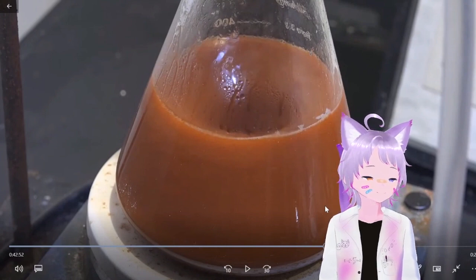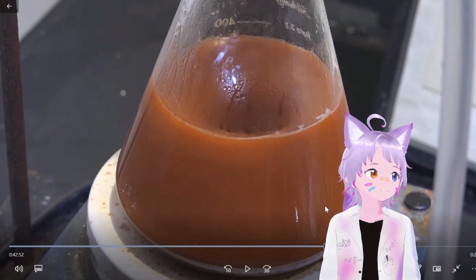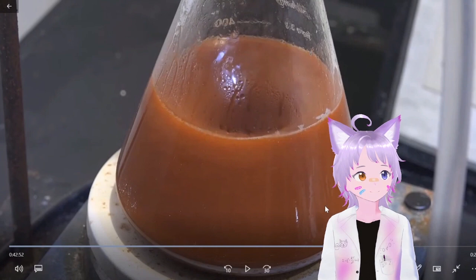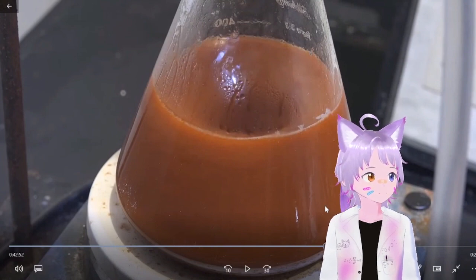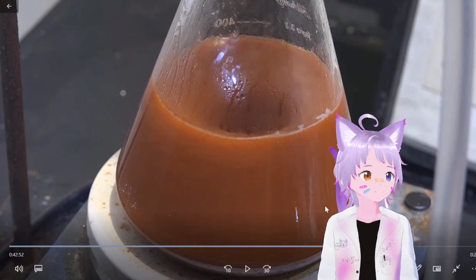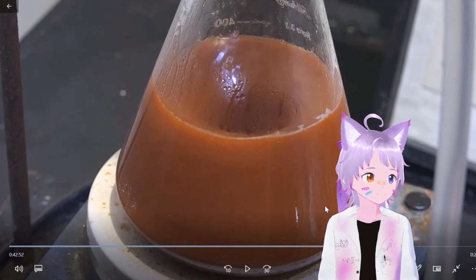Or install it. I found a really interesting method for stirring, especially for foaming. You keep stirring really high. And if it starts foaming, what you could do is instantly turn off stirring and lower the heat, the heating mantle. And that pretty much solves it all. Yep. It would give you maybe 30 seconds to a minute of control. If you leave the heat on, obviously it would start foaming again.